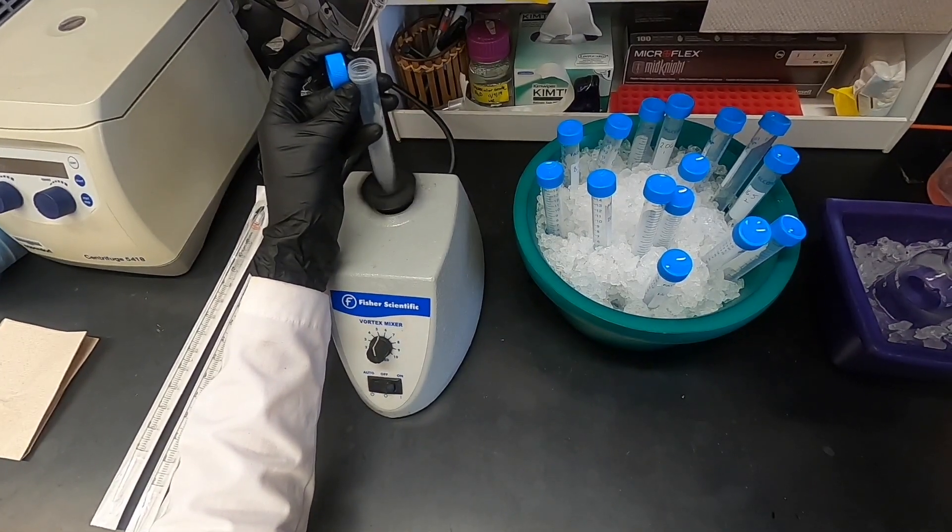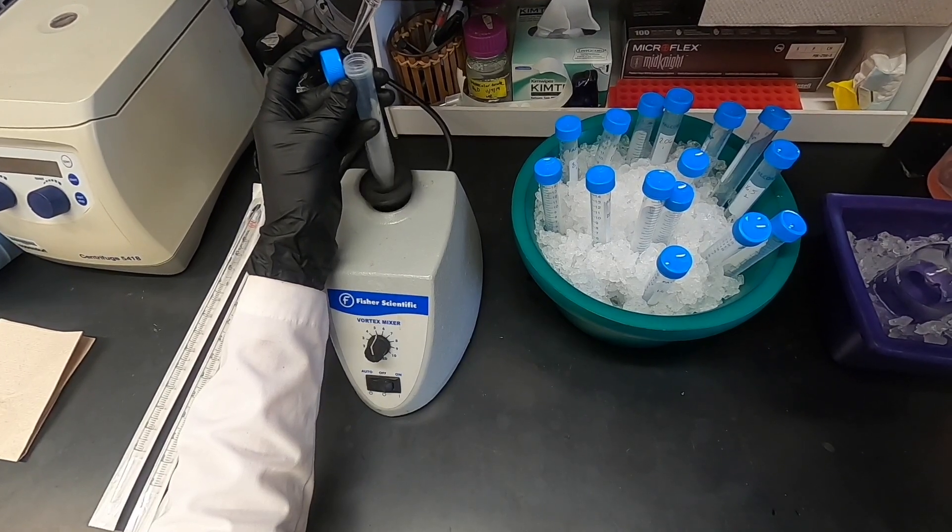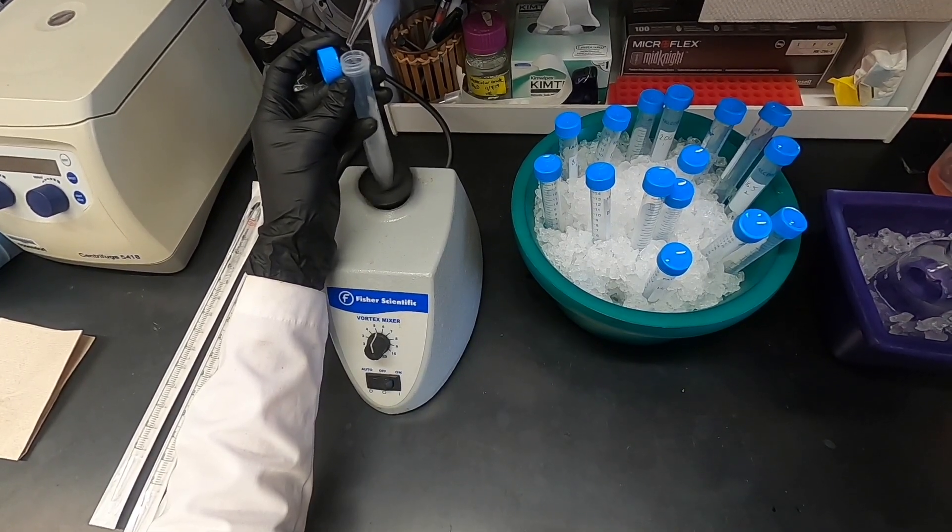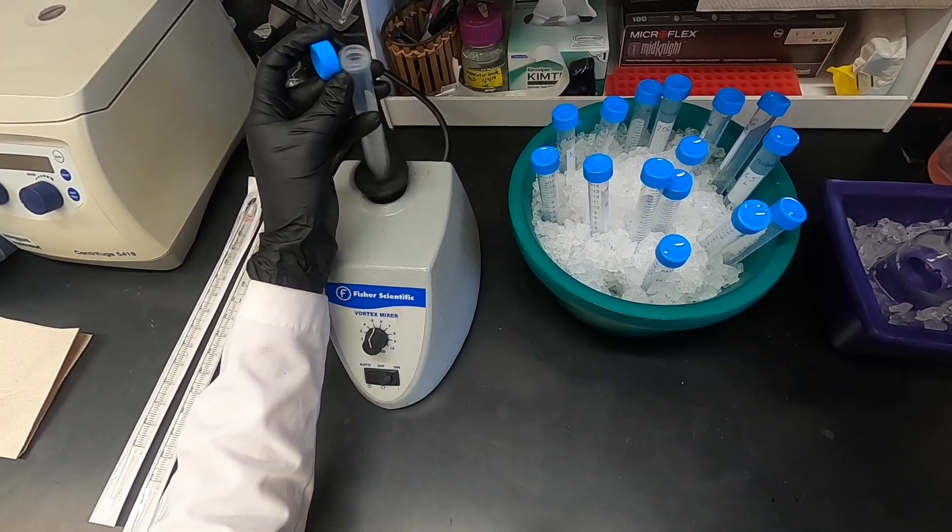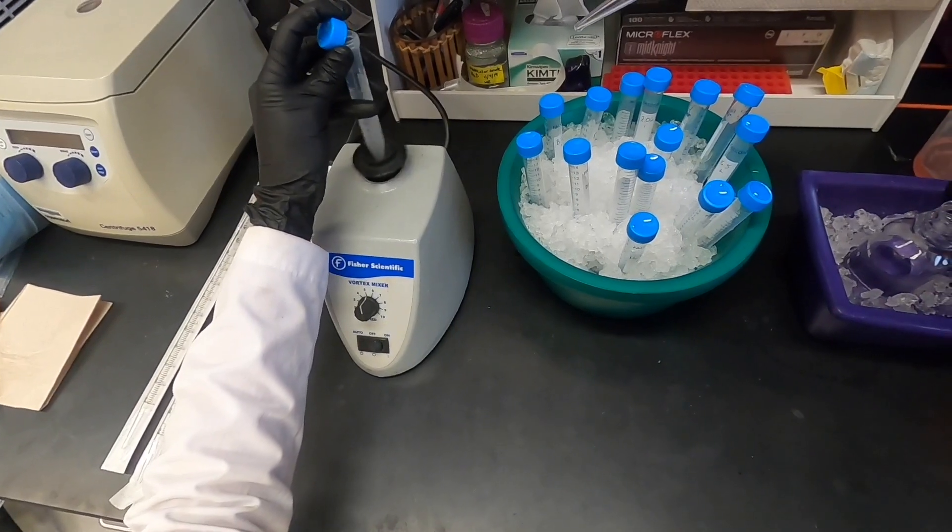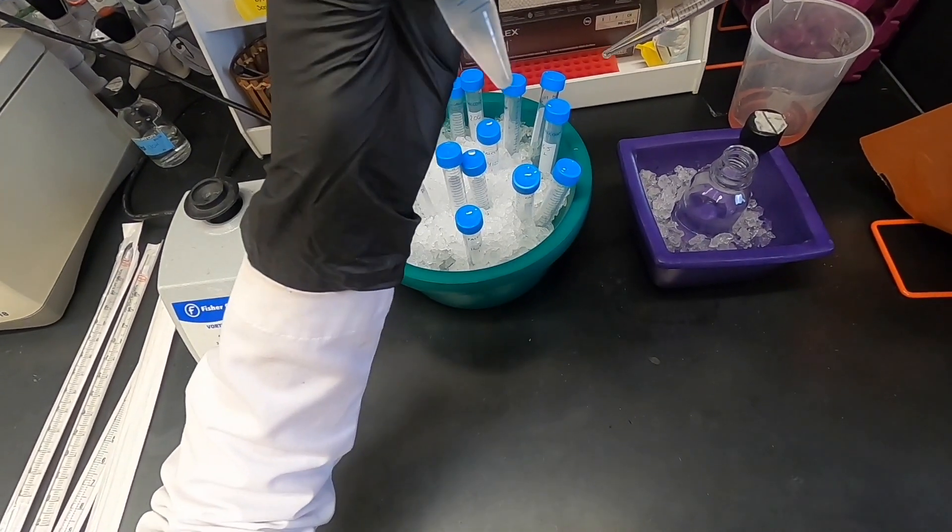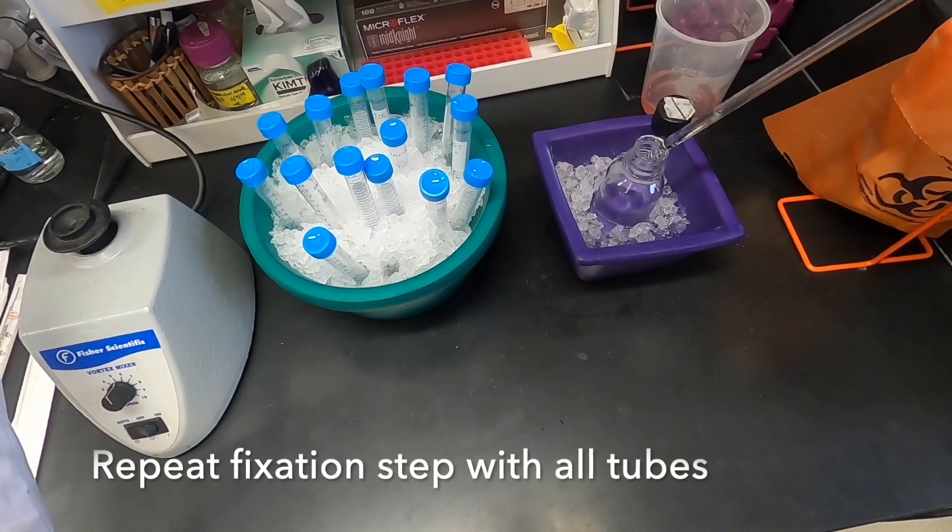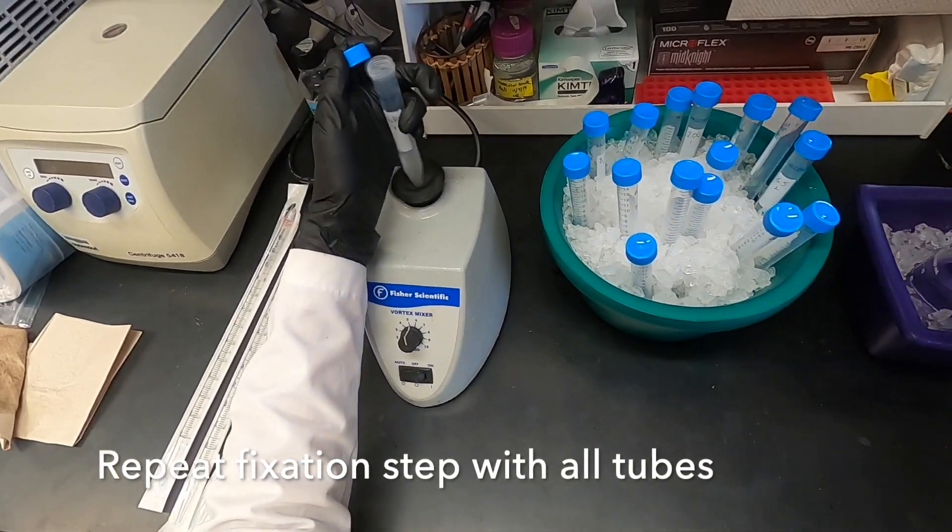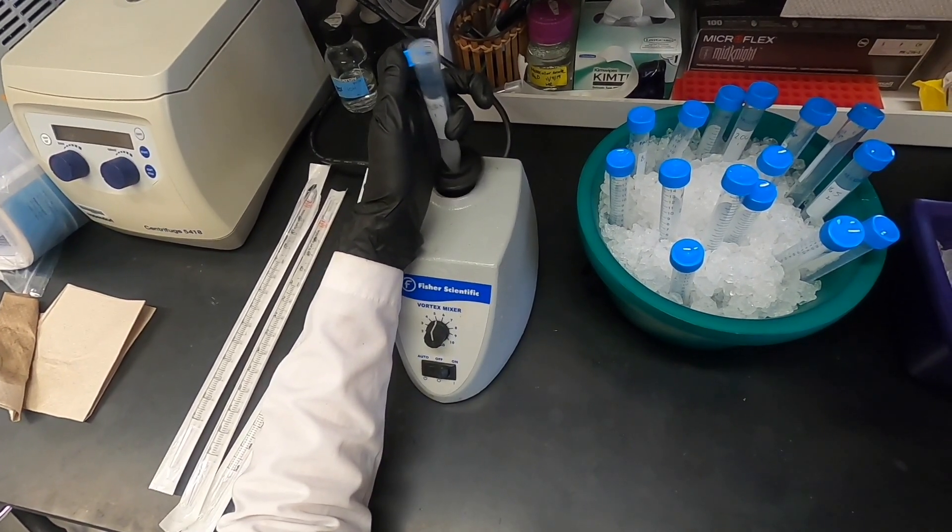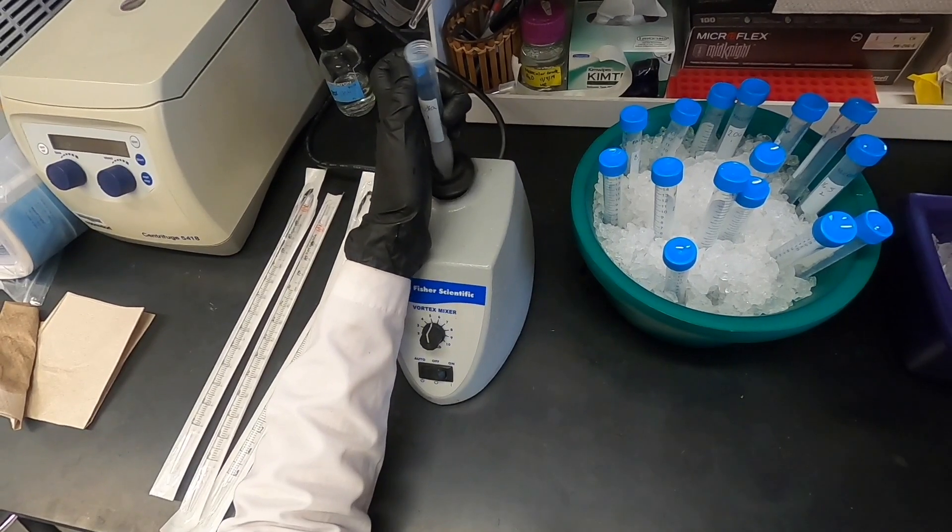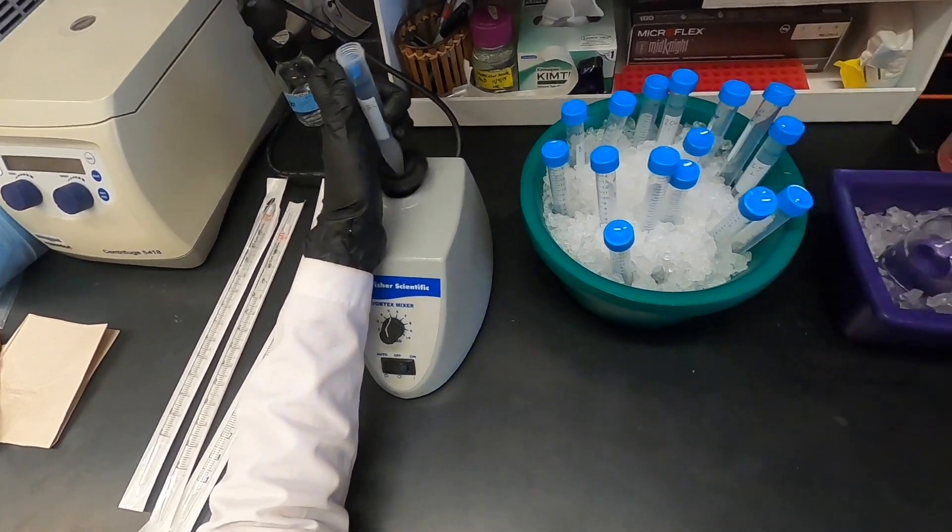Ethanol fixation and permeabilization is an important step when working with PI. If you remember from our cytotoxicity assay, PI is not permeant to living cells. Therefore, permeabilizing them with ethanol will allow the PI to enter the cell membrane and stain the DNA. We will now incubate our tubes with 70% ethanol for 15 minutes on ice.